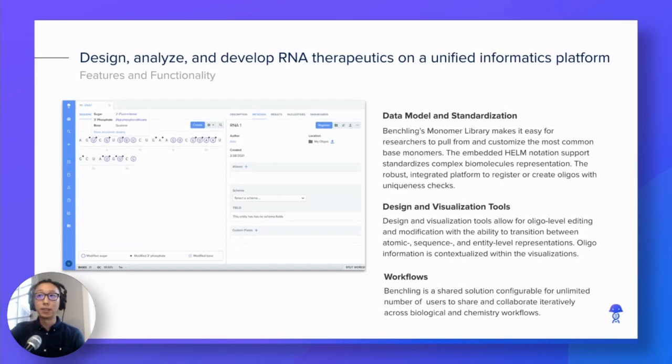As with all data captured in Benchling, the aim is to really increase the ability of scientists to accurately keep track of all of their underlying data assets, as well as any associated experimental results in a highly structured manner to ensure high data integrity.